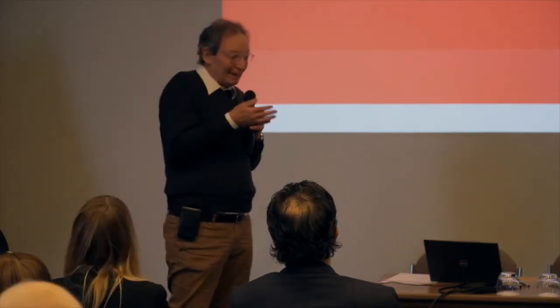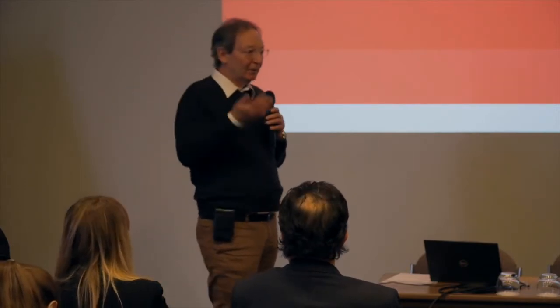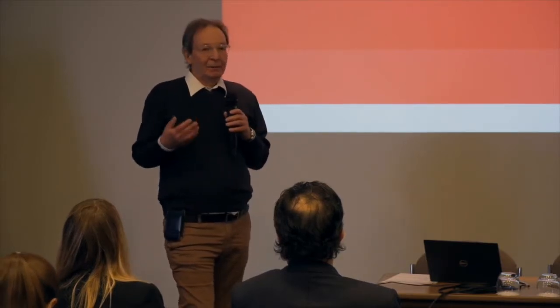What I can tell you is that if we would go with, let's say, half the resolution or three times the resolution number, so 6-10 microns or so, things will be much easier. That's for sure, because I can then increase depth of field. I lose a little bit in lateral resolution, but I gain enormously in depth of field.